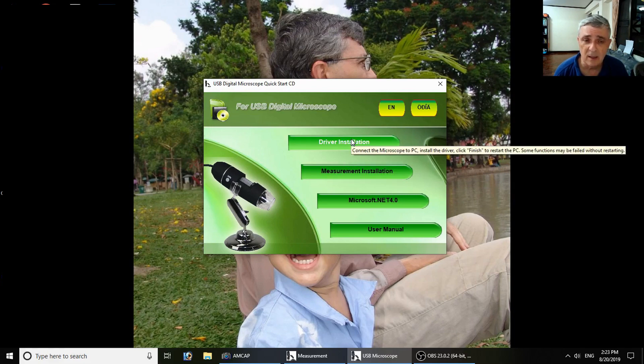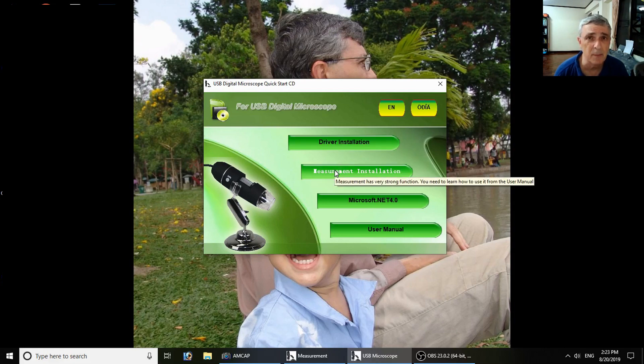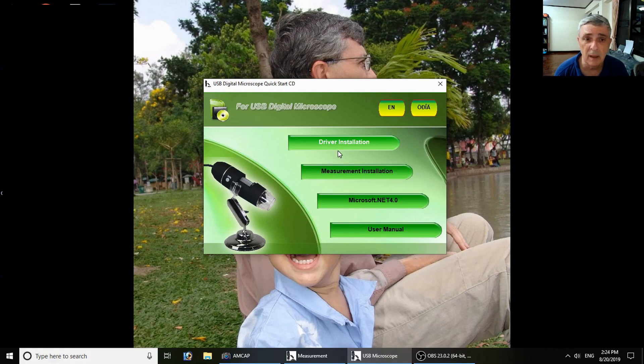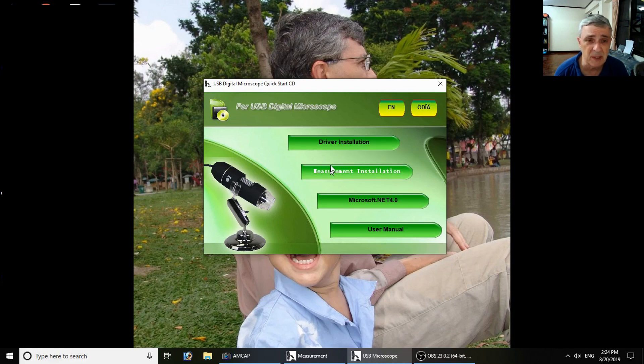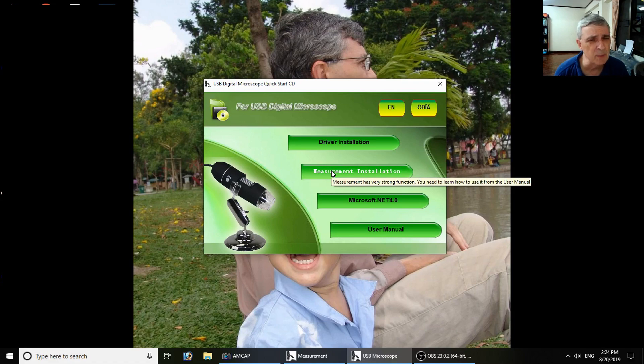I installed both of these. I did not install them on my C disk. This second one, the measurement software, had problems on my C disk, so I moved it to my D disk where it wouldn't have permission problems and crash. Otherwise, it's pretty standard installation, pretty simple.